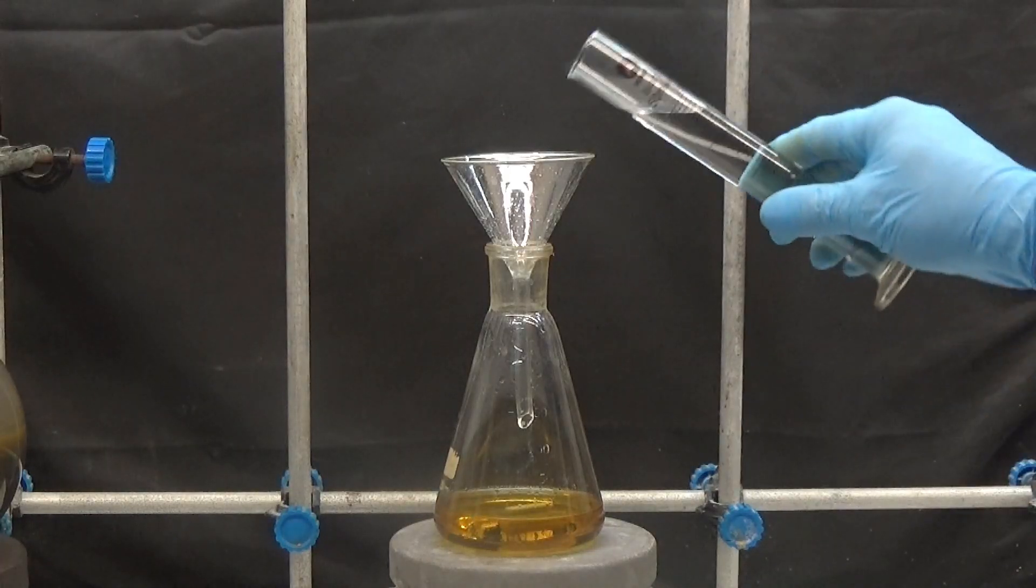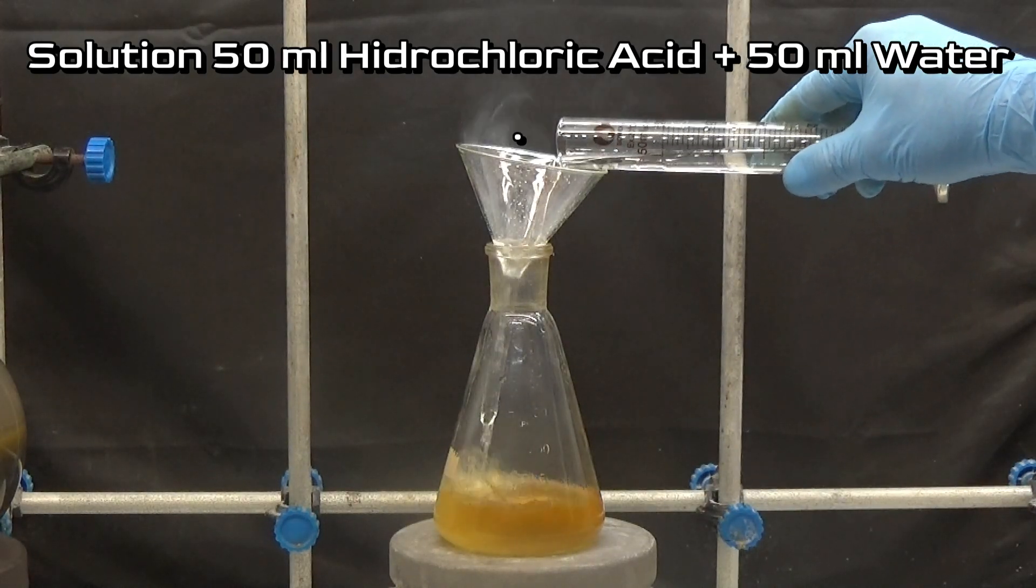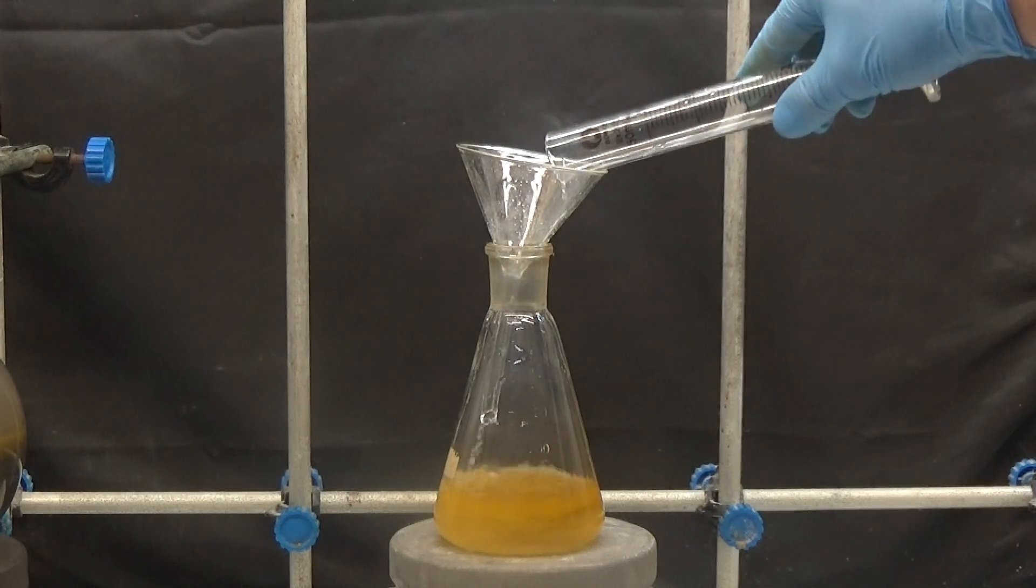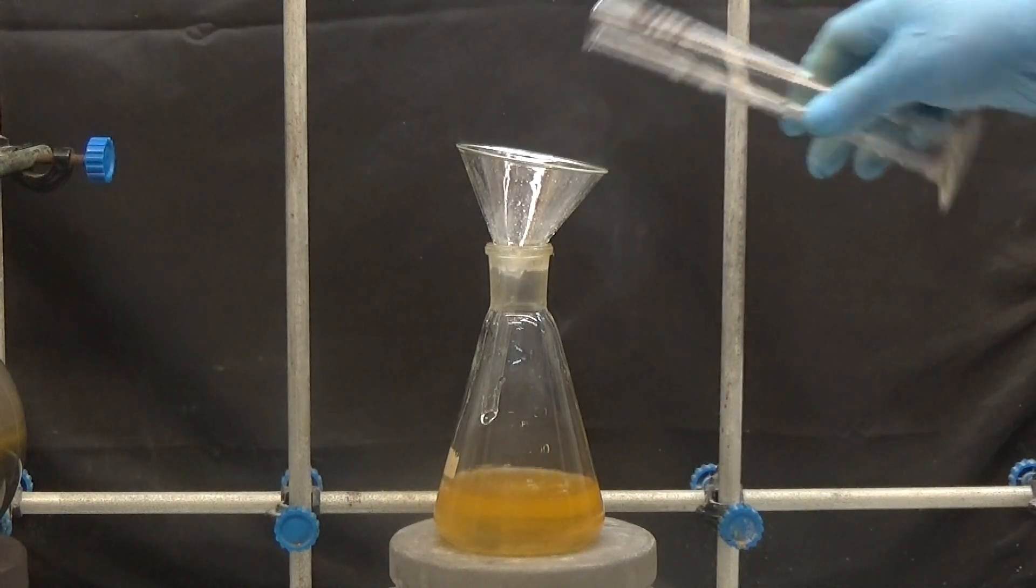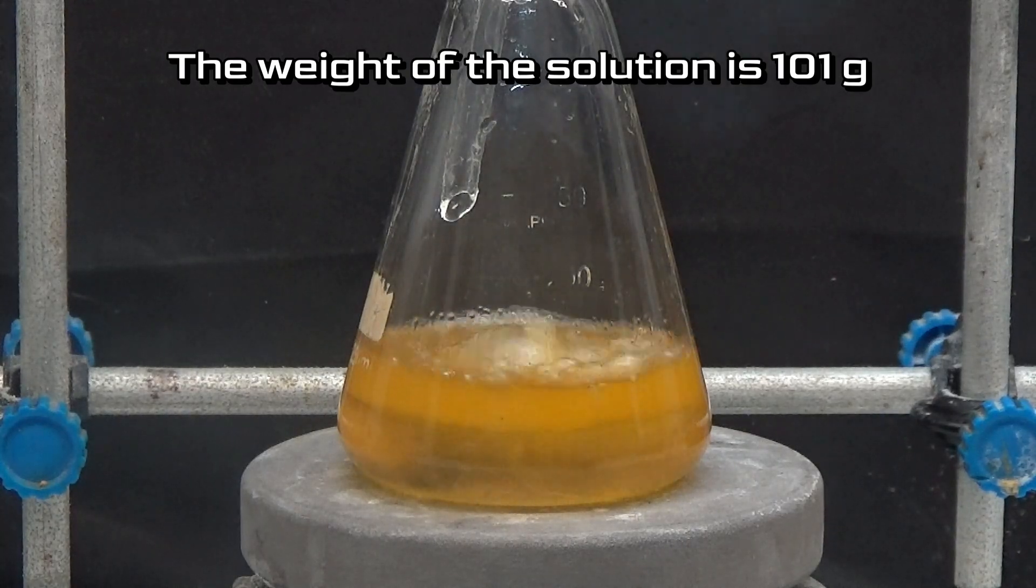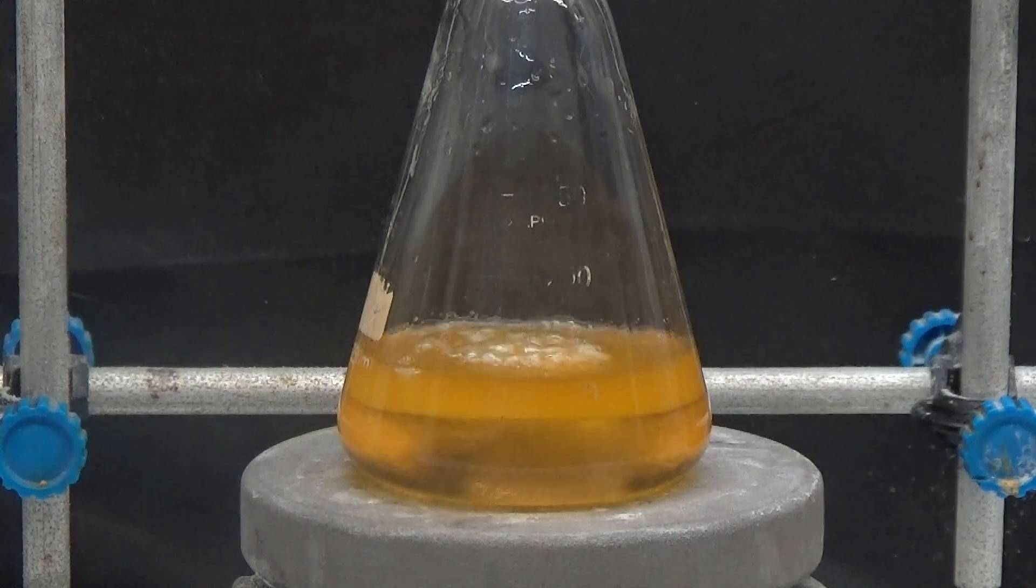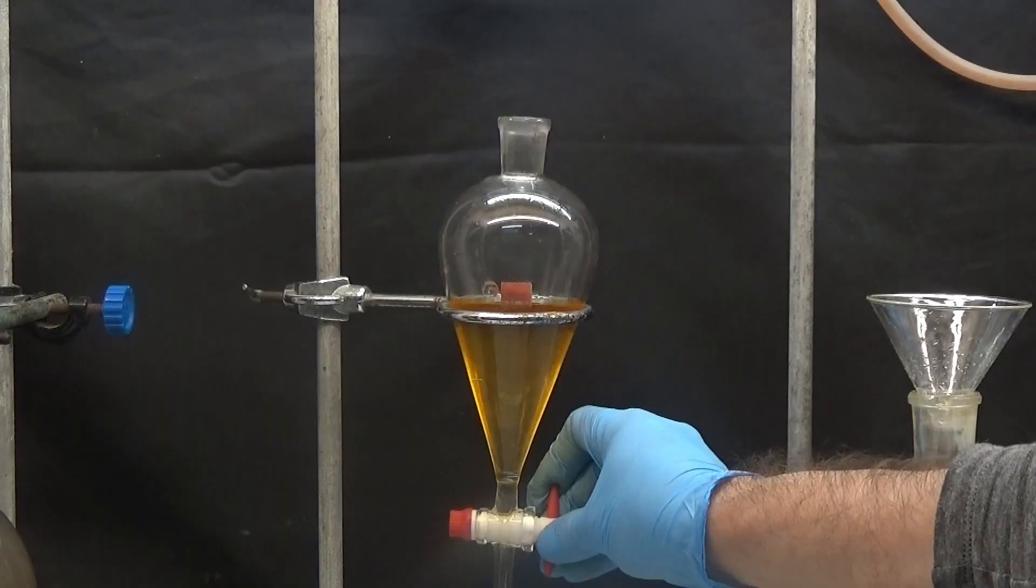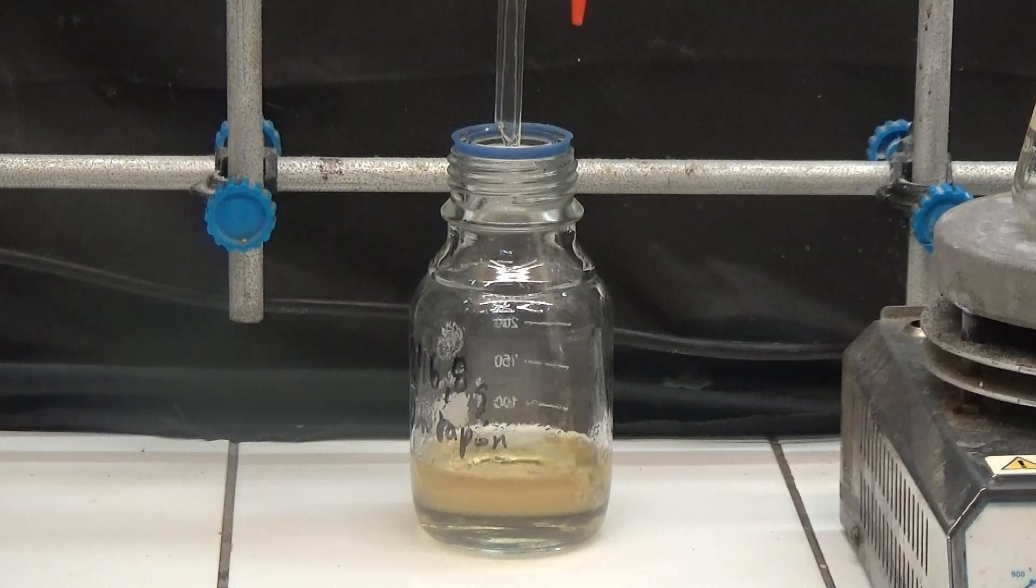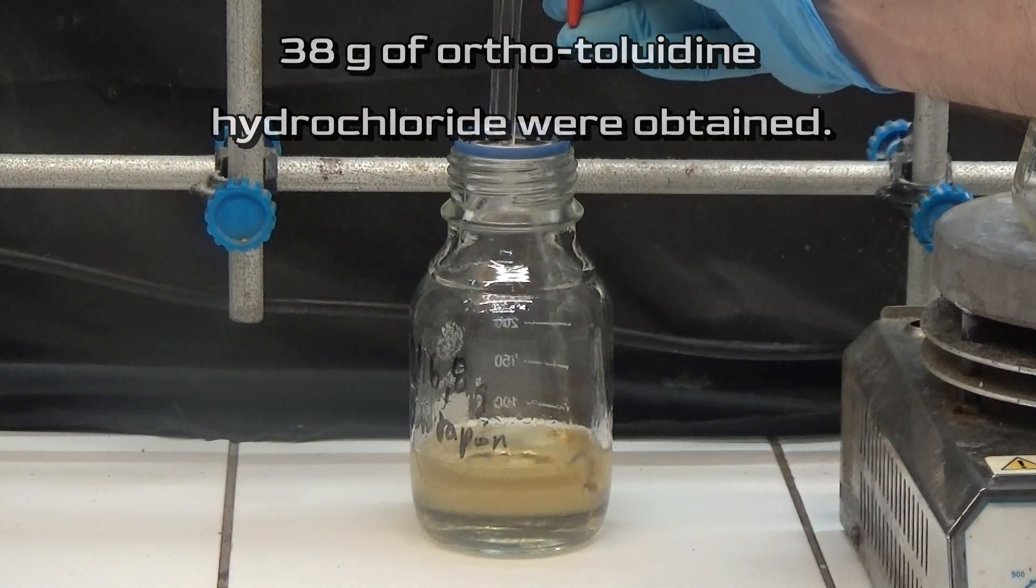Prepare a hydrochloric acid solution by diluting 50 milliliters of water in 50 milliliters of 36% hydrochloric acid. Weigh the solution to know the amount of orthotoluidine hydrochloride that we are going to extract. The weight of the solution is 101 grams. We shake the ether solution twice with 50 milliliters of the hydrochloric acid solution. The total weight of the hydrochloride solution is 139 grams. 38 grams of orthotoluidine hydrochloride were obtained.